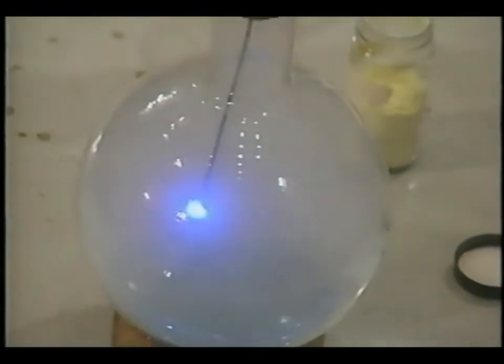Sulfur dioxide, we can begin to see some fumes. If you look closely, you begin to see some fumes, and we are forming sulfur dioxide, which itself is a pollutant. Air pollution and smog have in them, among other things, sulfur dioxide. So if we turn the lights back up, please. Now, see, it's still burning.